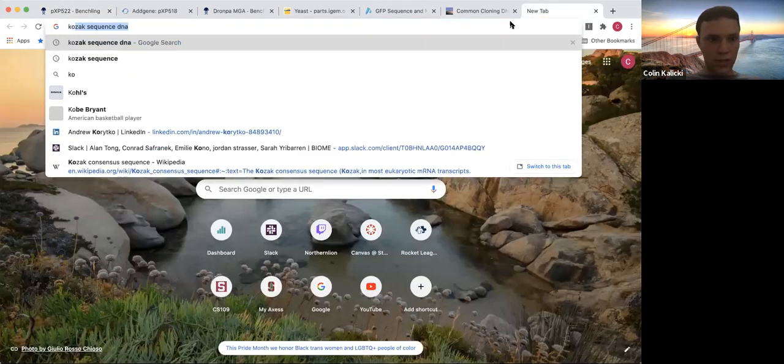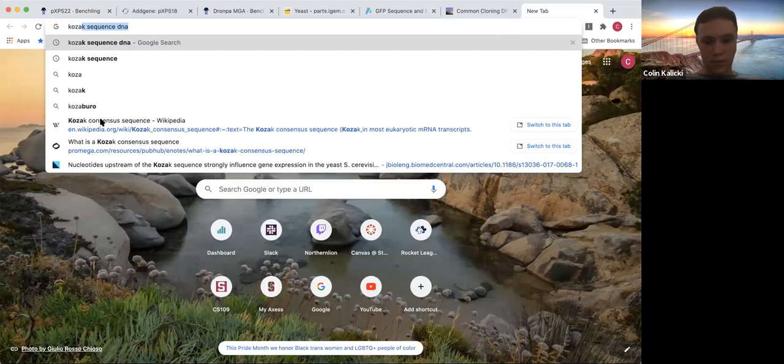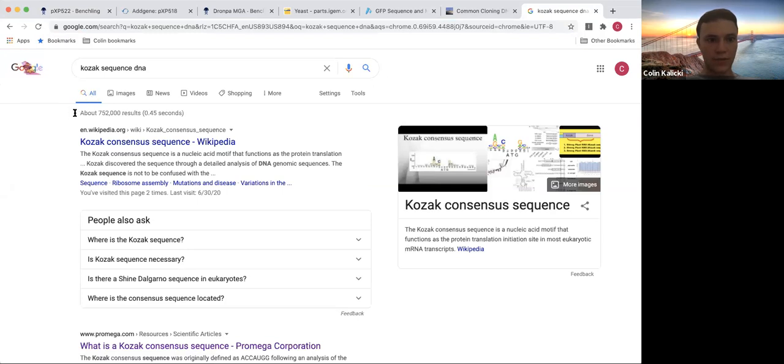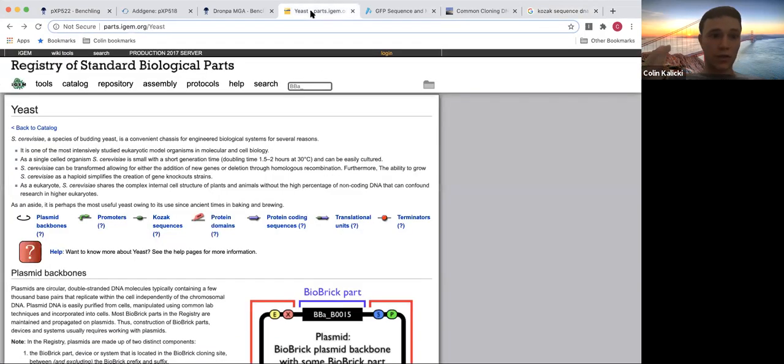It's a Kozak sequence. Oh, whoops. Kozak sequence, DNA. That's great. Here's a great website, and I'm actually going to chat it to you all now, where you can actually find this stuff and more. Be a little careful because they're not always the best.